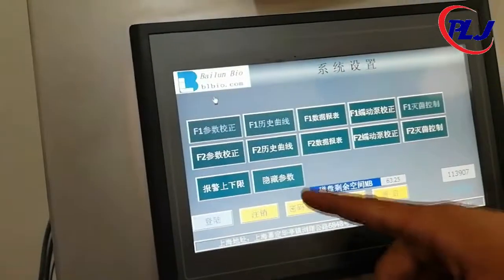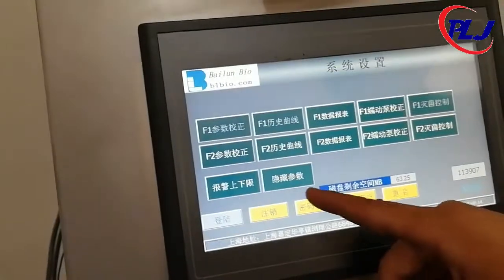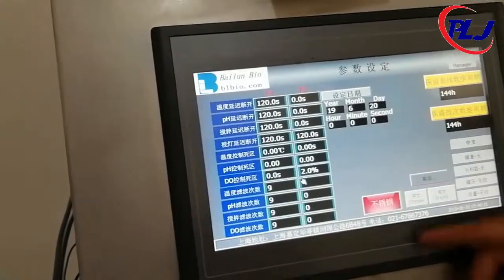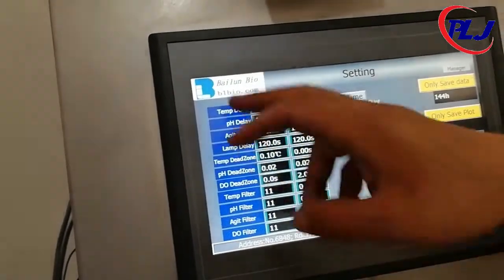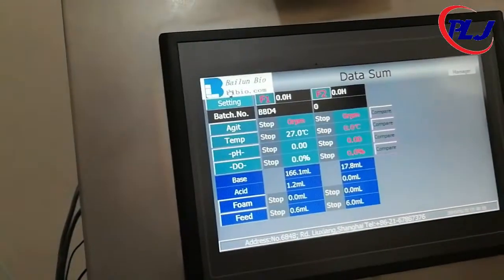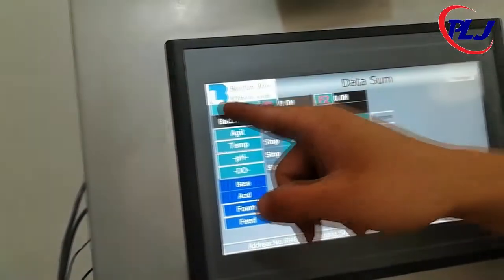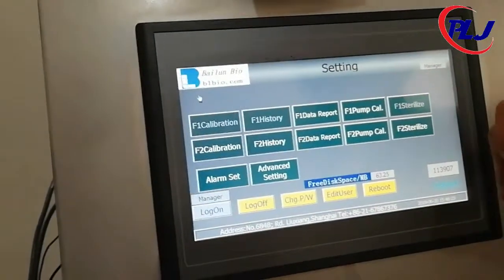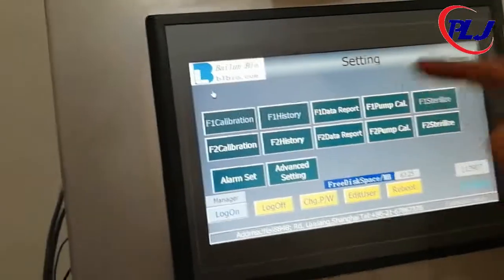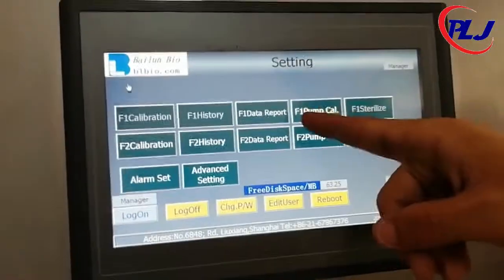Click the button in the first row and first column, then click the button in the second column, last row. Finally, you will see an English button on the lower part of the screen. Click it. To go back, just click the settings. During this, a pop-up window may come up with the username and password. Select the manager username and key in 1 as the password.